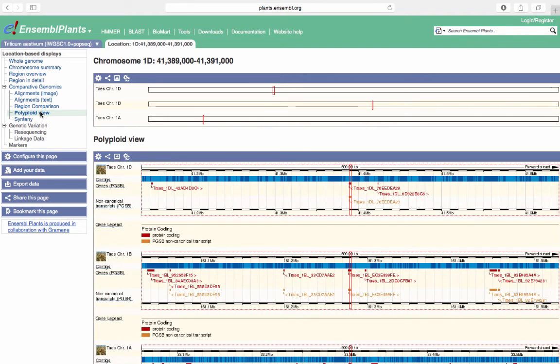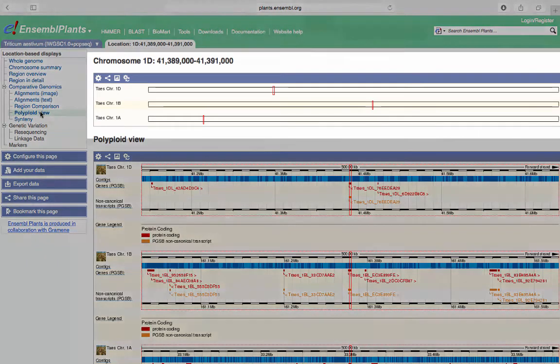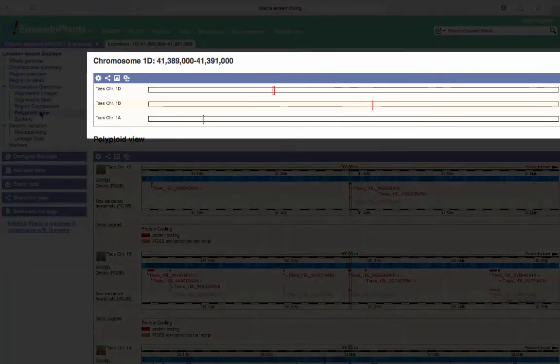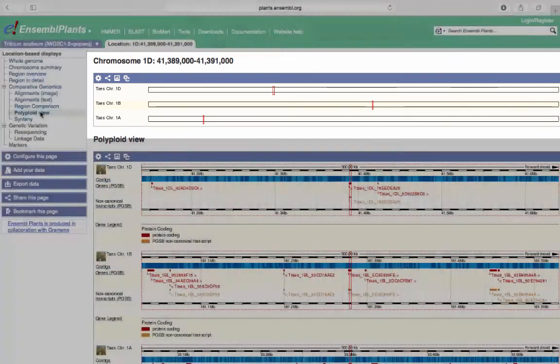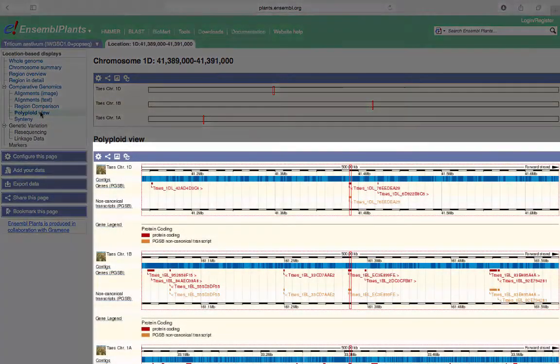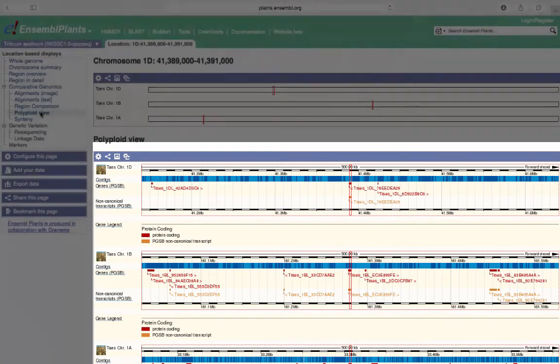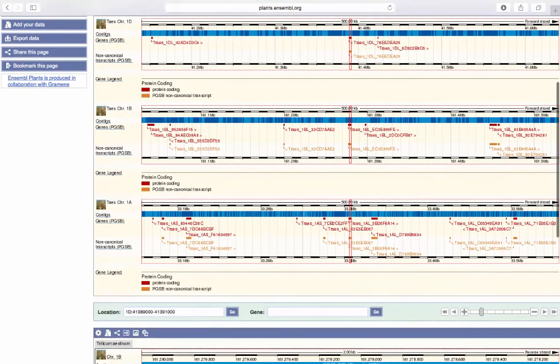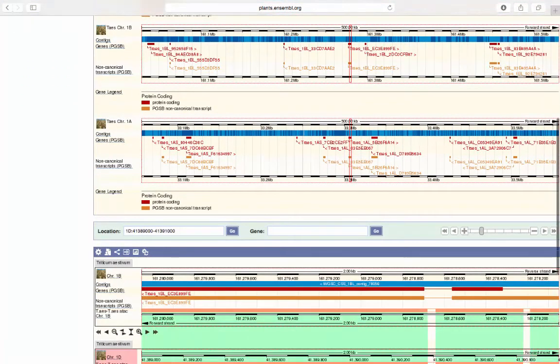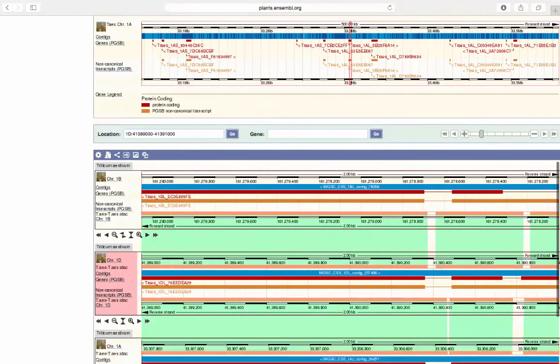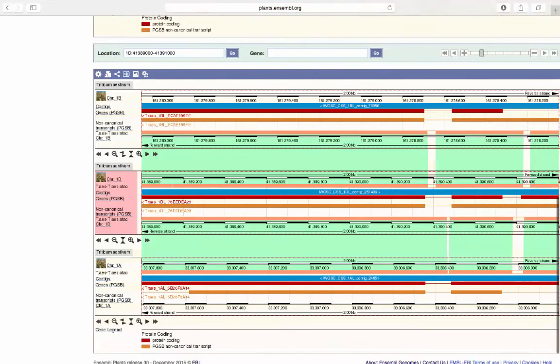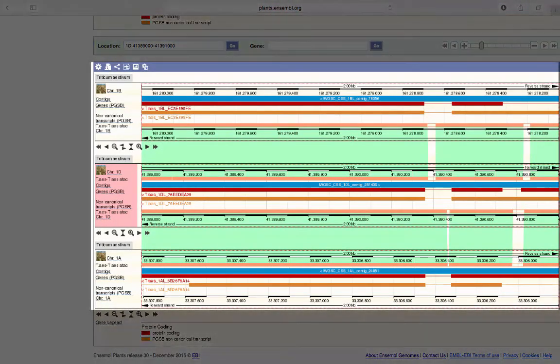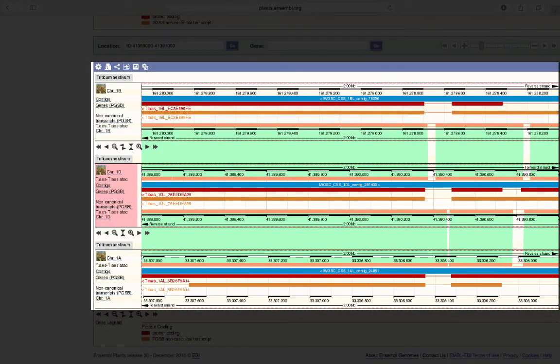In this view, you can see alignment of comparative regions between the three independent genomes at a chromosomal, regional or individual gene scale.